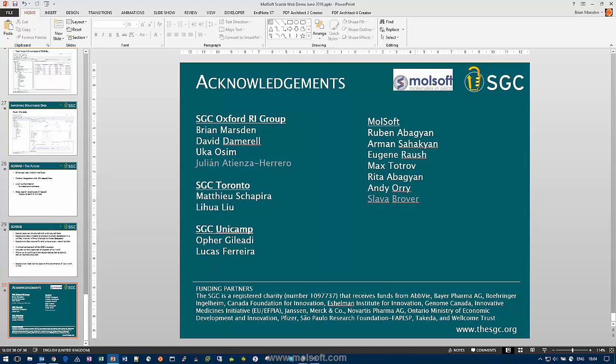I should say that many databases are well designed, but there are many databases that are very poorly designed, and Scarab can only work with what it gets. And I would say that often third-party vendors' databases are not as clean and as clear as they could be, and therefore more work is required to tweak Scarab's understanding of that database so that it's presented in a way that makes sense to the end scientist.